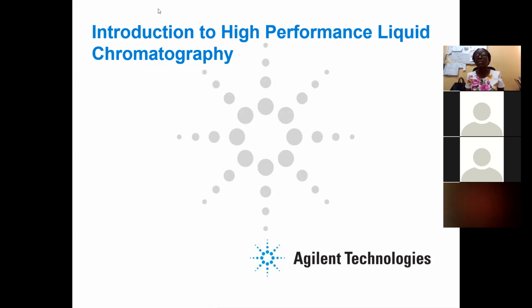Then I will now plot a graph of my concentration against my peak area. If this is my x-axis, my concentration, and the y-axis is my peak area, and I plot that, I will get a linear graph, which is similar to what you did with your Beer's law. So now this is my concentration on this axis, and this is my peak area on the other axis. So now I get what we call a calibration plot, which is a plot of concentration versus peak area.